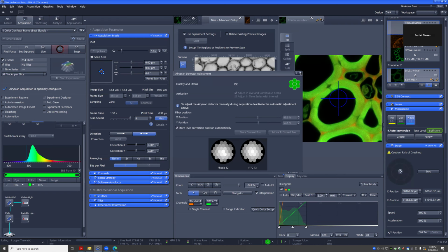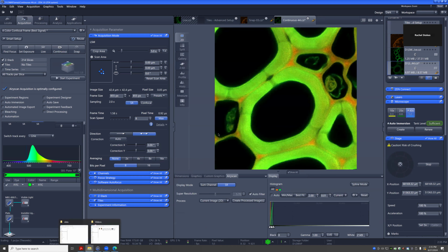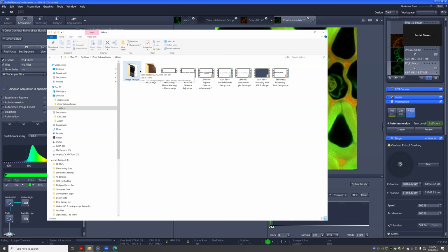There is an exception. I can't really do it with this plant sample, but I put some instructions in a PDF here. If the bright spot for a different channel, a different color, is different, then you do want to find it. But for red and green, I would say if you align on the green, you're good. If you're zooming up and you don't have something bright in the sample, there's not much. Yeah, you would have to zoom out a bit.